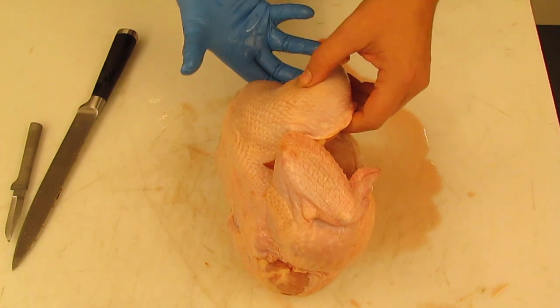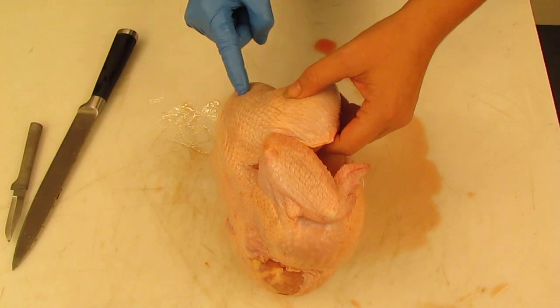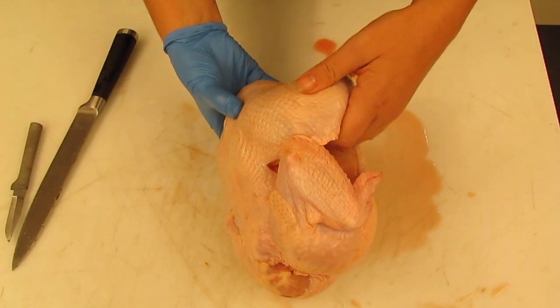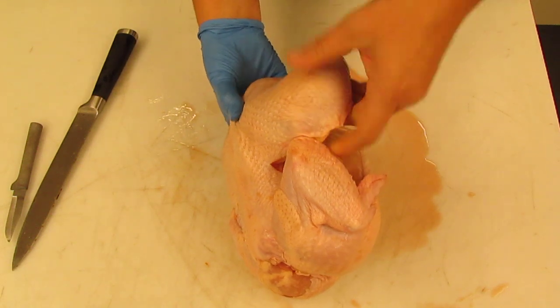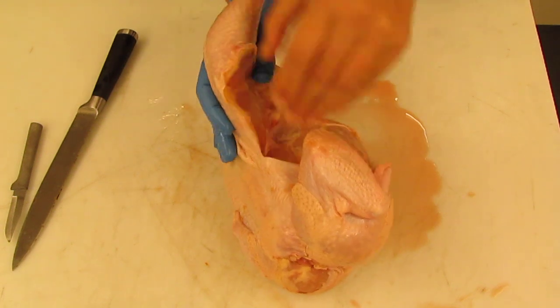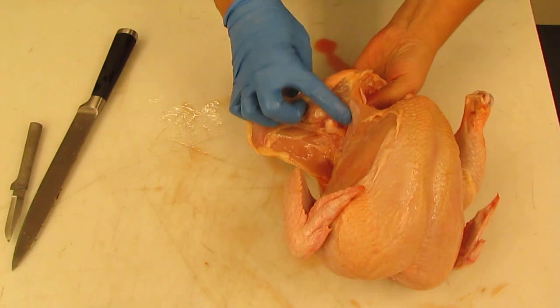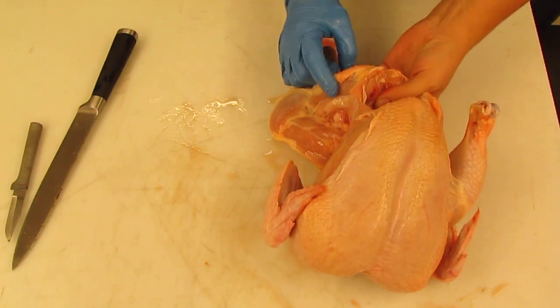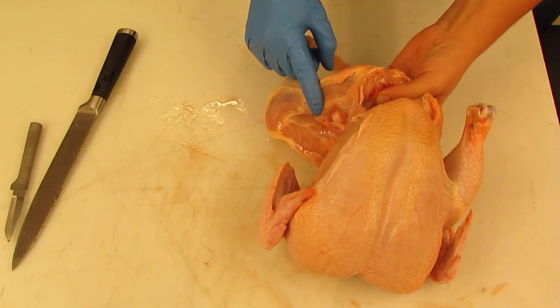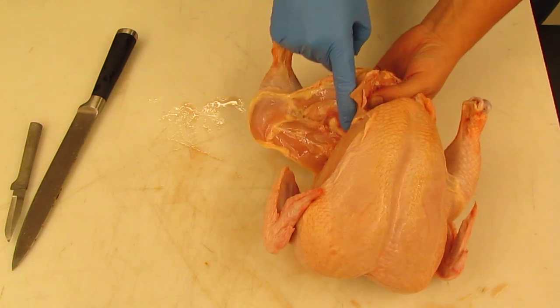And so I want to literally dislocate the hip, and to do so, I'm going to push on what I feel is the femur and at the same time pull on the knee over here. Okay, and so I just dislocated the hip. And so if I look in here, I can see the head of the femur, okay, and the greater trochanter, which we'll get into, as well as the series of muscles.